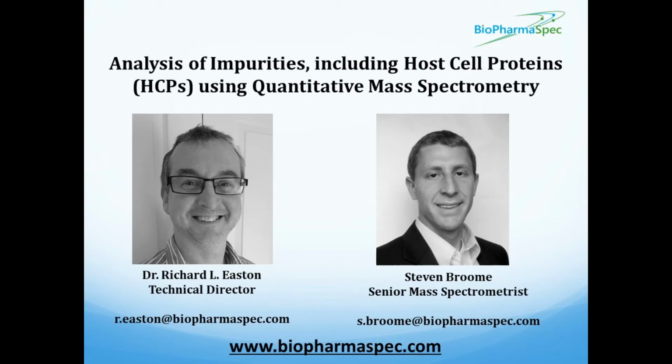Yeah, sure. So as you mentioned, ELISA is a very common and actually considered the gold standard approach to assessing host cell proteins, and it's for good reason. ELISA does a great job of providing low-level detection and quantitation of host cell proteins. And ELISA is specifically well suited for routine testing, where you need to run the test many times. If you contrast that with mass spectrometry, mass spec isn't quite as good for these routine tests because the data generated with the mass spec analysis are much more complex. You need a lot more expertise to analyze the data, and they're relatively higher cost to run.